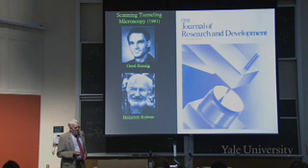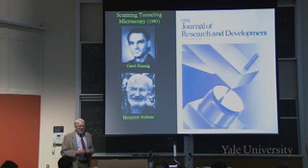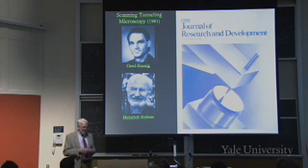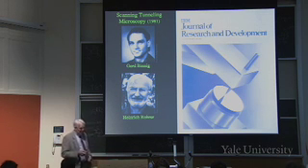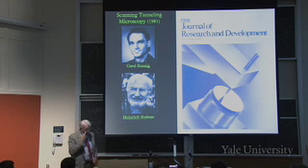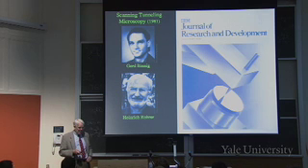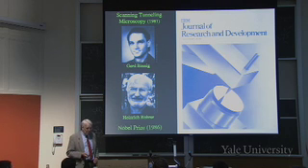Right? So scanning tunneling microscopy was invented in 1981 by these guys in Zurich, Gerd Binnig and Heinrich Rohrer. And here's the first publication. They worked at IBM. And here's the first publication on the cover of their journal about a meeting about this new technique, scanning tunneling microscopy. And they got the Nobel Prize within 5 years, or maybe even less, very short order, 1986.